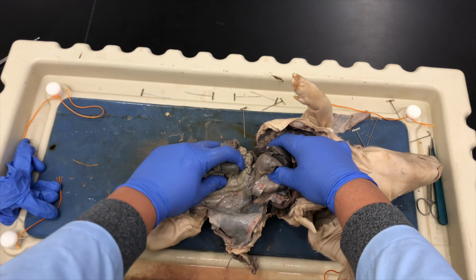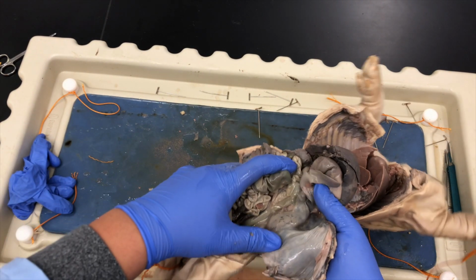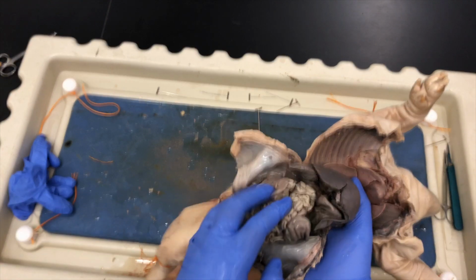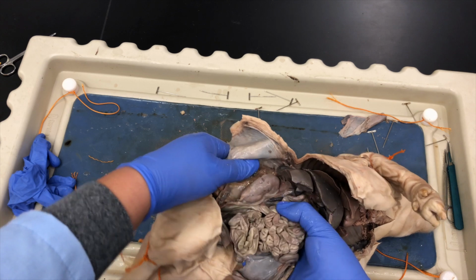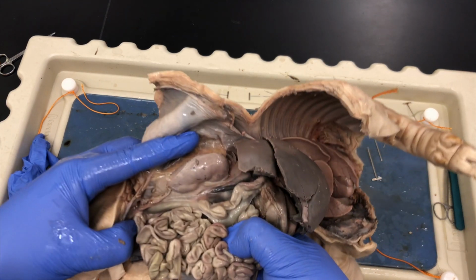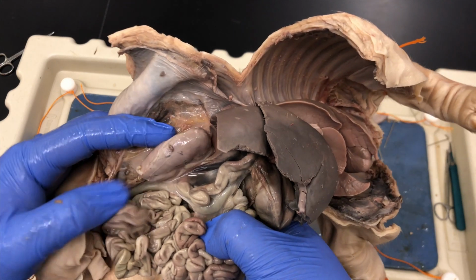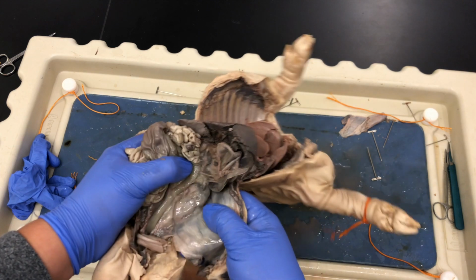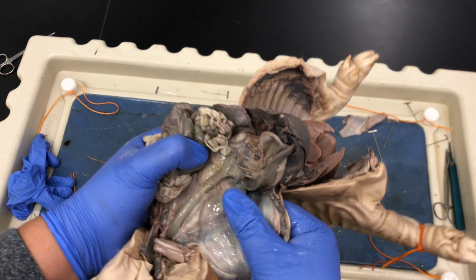If we really look in there, we could also see the kidneys. So here's one of the kidneys. And on the other side, I was able to cut it out a little better. Here's the other kidney. Here's that kidney. And here's this other kidney right here.